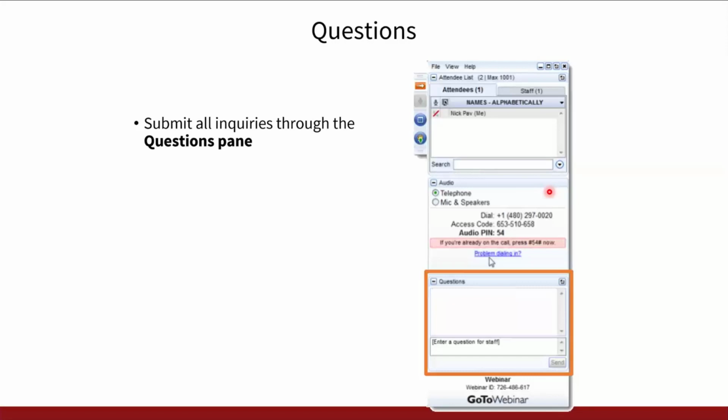Let me start with, okay, for the high resolution TEM images, what kind of dose have you been using and what detector are you using for this work?